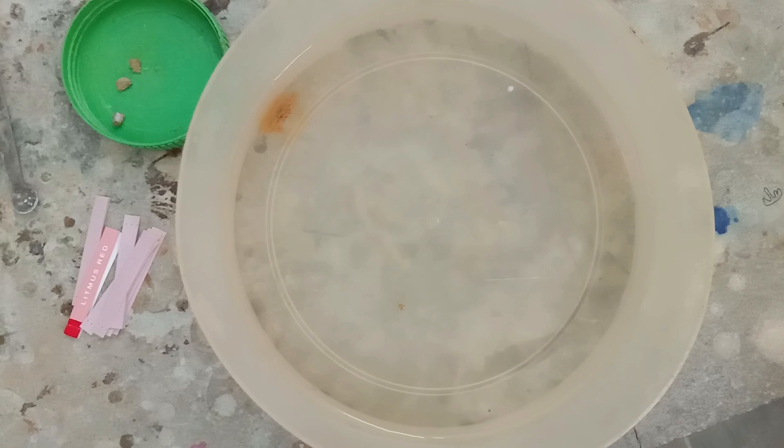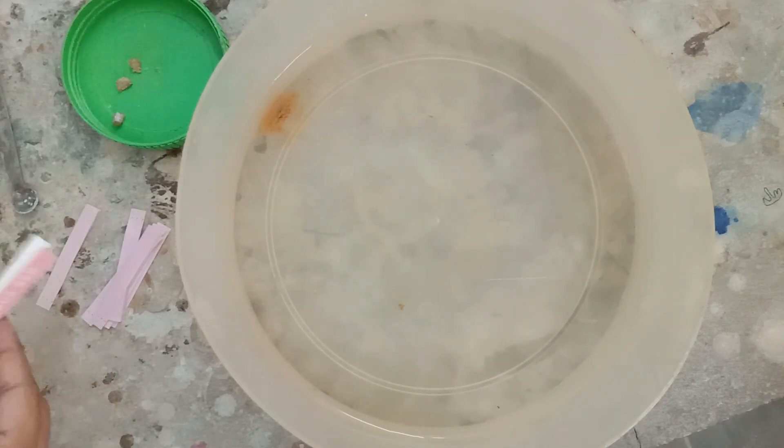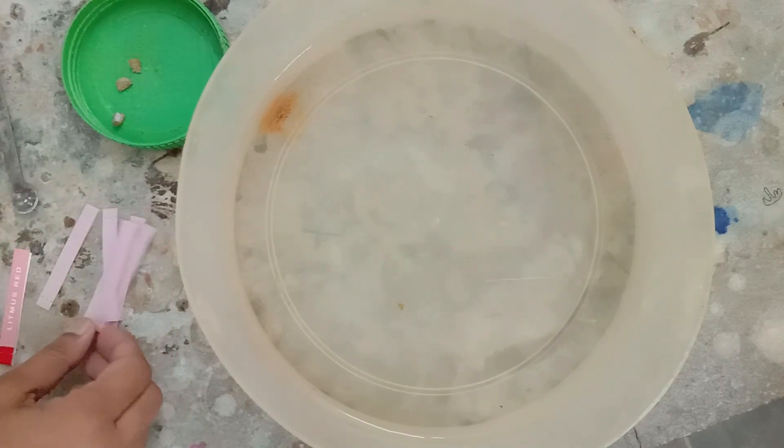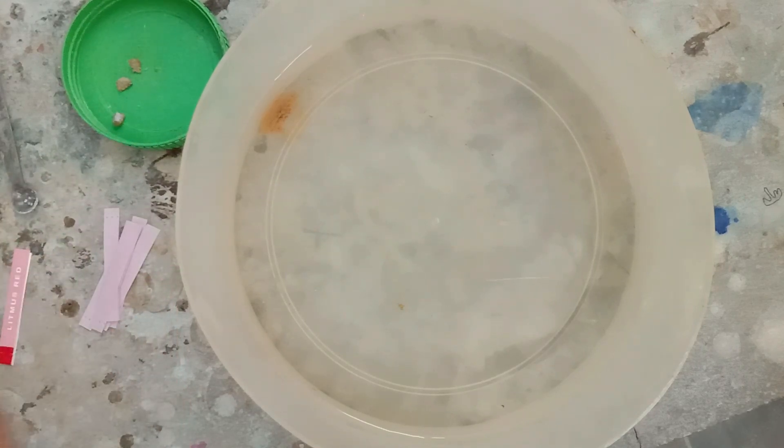Sodium hydroxide (NaOH) is formed as a result of this reaction. You can clearly see that the size of sodium is decreasing and it is going to disappear, because sodium has converted itself into NaOH and hydrogen gas which is displaced out. Now we have taken a red litmus paper to check the presence of a base.